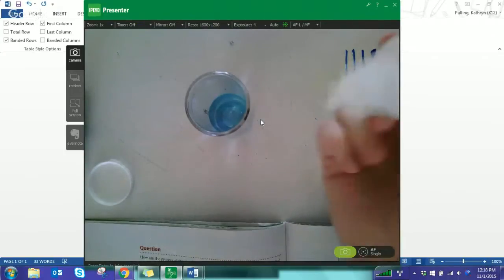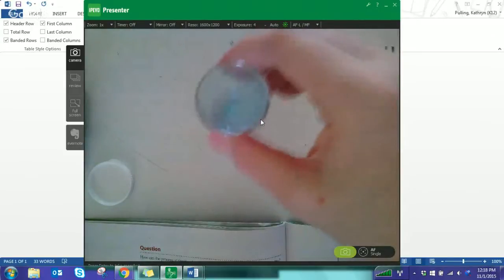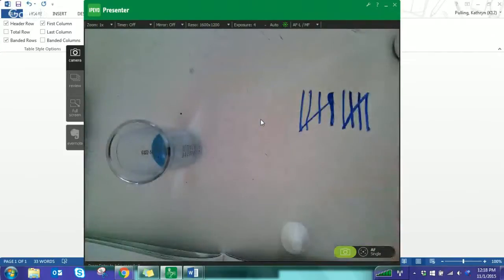Right? There should be a vocab term that you're thinking about here, something in the solution that is holding the pH as close to neutral as possible, or holding it in a range for a longer period of time. Okay, so that was drop 11.